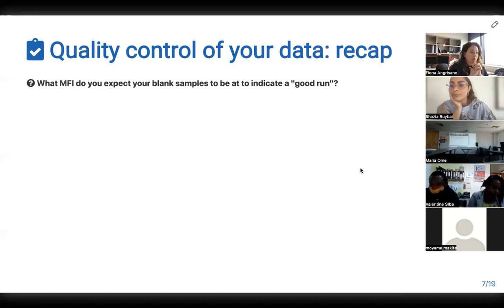I just remember less than 100. So less than 100. Yes, whoever said that, that's correct. We usually would like it to be under 50, but yes, 100 is also considered okay.